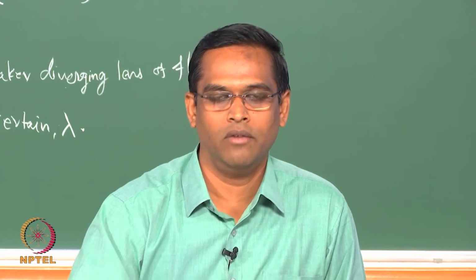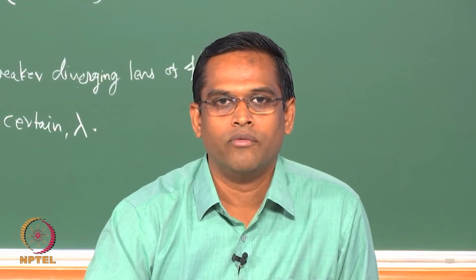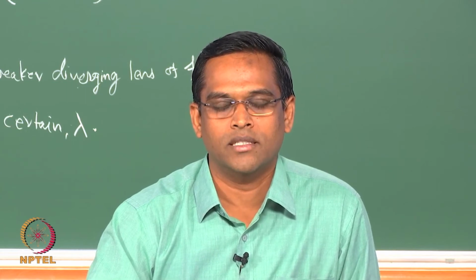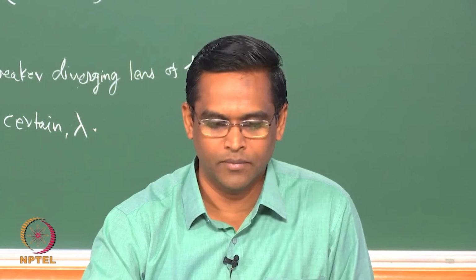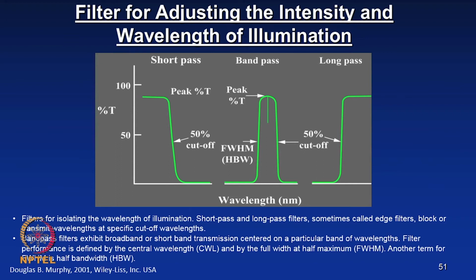If you recall that table which we have shown, the kind of useful magnification which the combination of these two apertures produces, now you will get an idea how the quality of a microscope is decided and how these two lenses, objectives and eyepieces, are selected. Okay. So, now we will move on to some other important parts of the microscope.